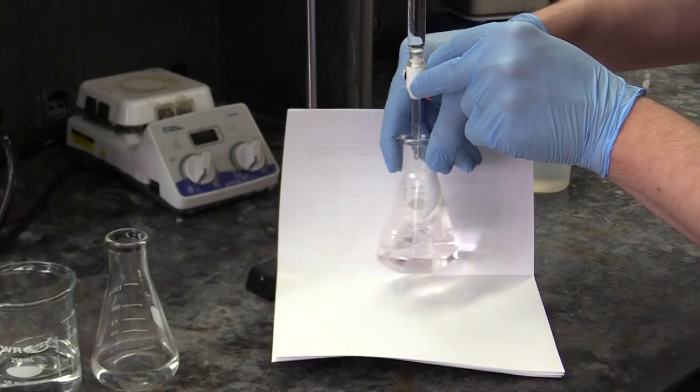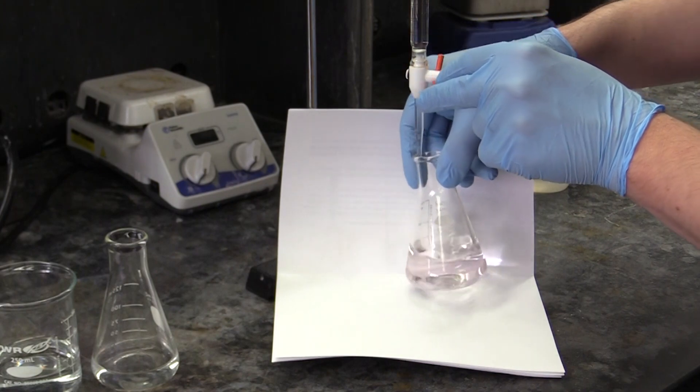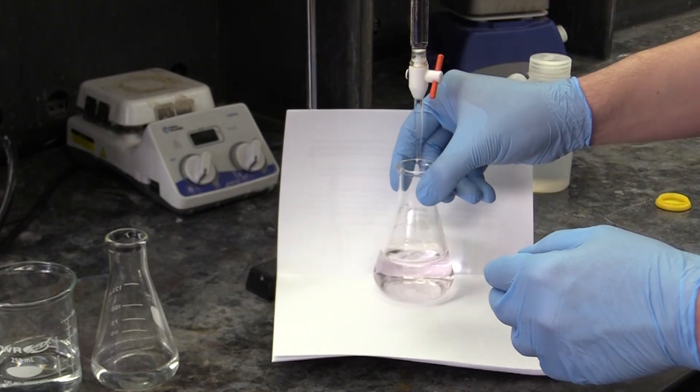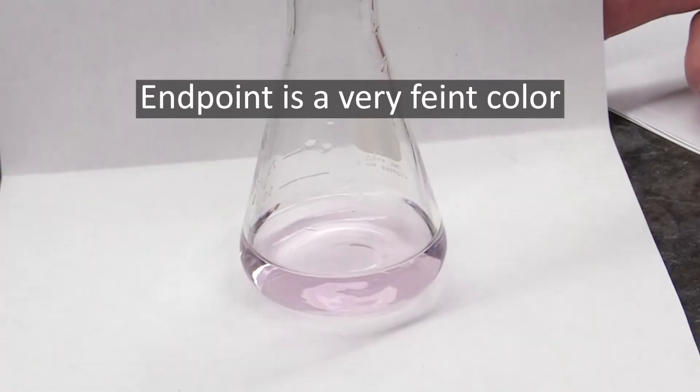For the titration itself, you will use a burette to add sodium hydroxide solution to the flasks until you reach the titration's endpoint, which in this case is when it turns a very faint magenta or pinkish color.